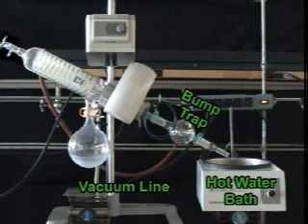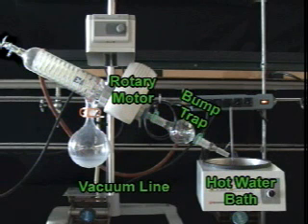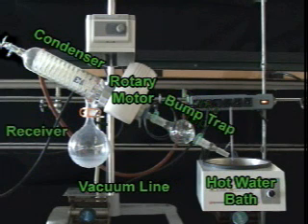A nice clean bump trap to which you will attach your flask. This useful piece of glassware will prevent any of your material from ending up inside the rest of the Rotavap. A rotary motor that spins your flask and spreads the solvent out on the flask walls. This creates more surface area and allows for rapid evaporation of the solvent. A cooled condenser to condense the solvent vapor from your flask, and a receiver to collect the condensed solvent. If all goes well, the solvent that starts out in your flask ends up in the receiver, while your material stays put in your flask.